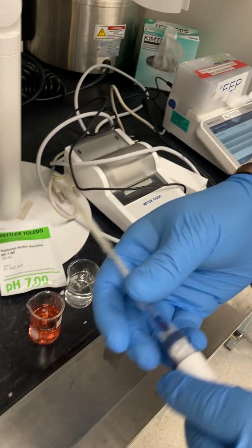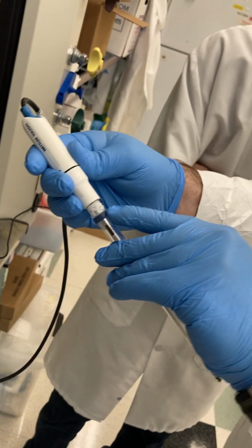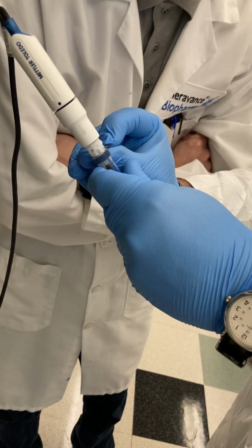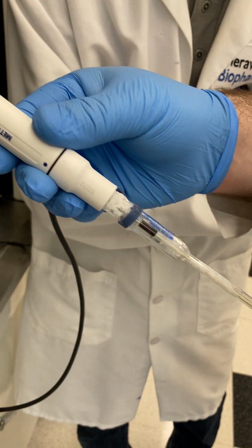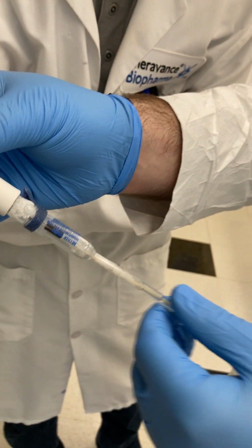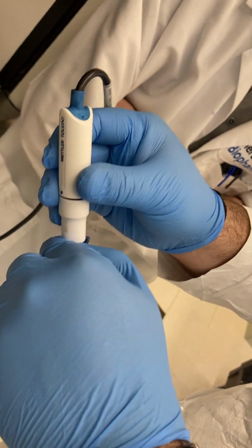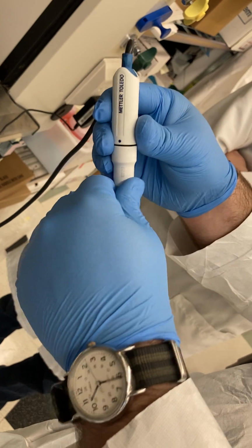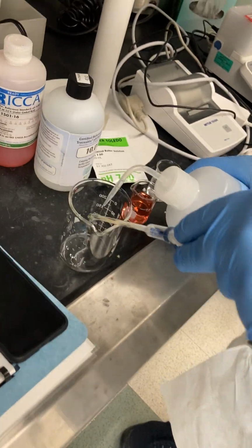So this is really bad. There's a hole right there. This is supposed to be in that hole, and that's supposed to help prevent the reference electrolyte inside from evaporating. Clearly, it's been opened and stored that way, and now has a bunch of residue on it. So we'll see how well this actually performs, but we'll at least give it a shot.